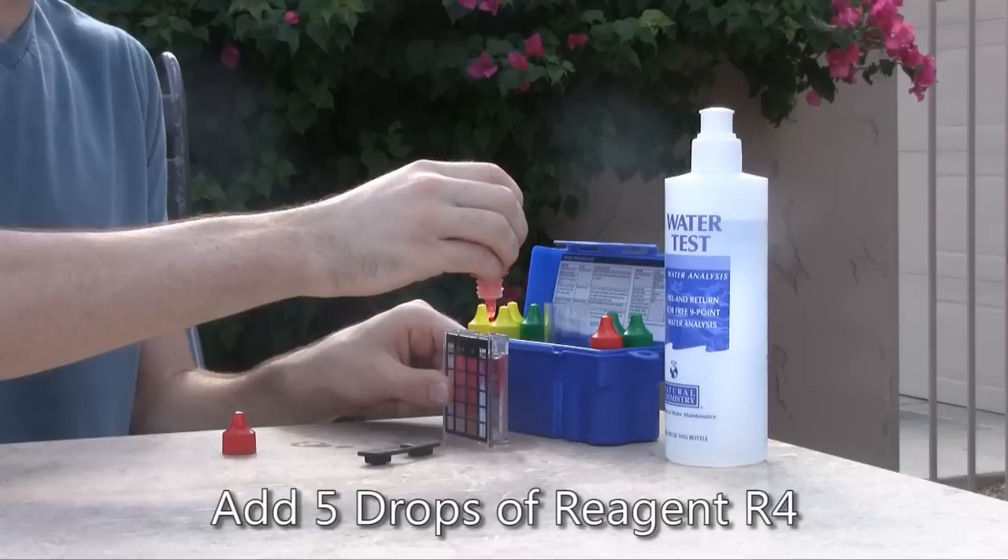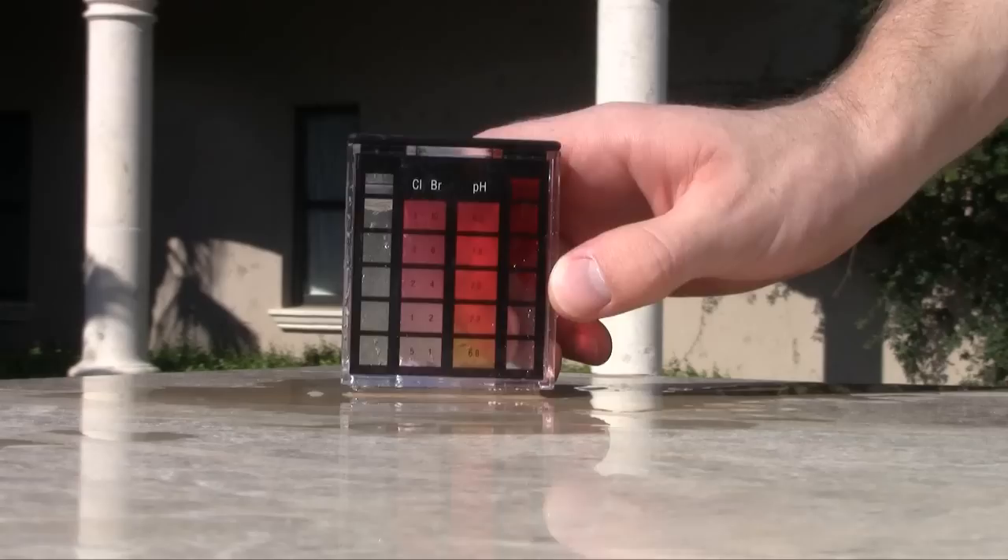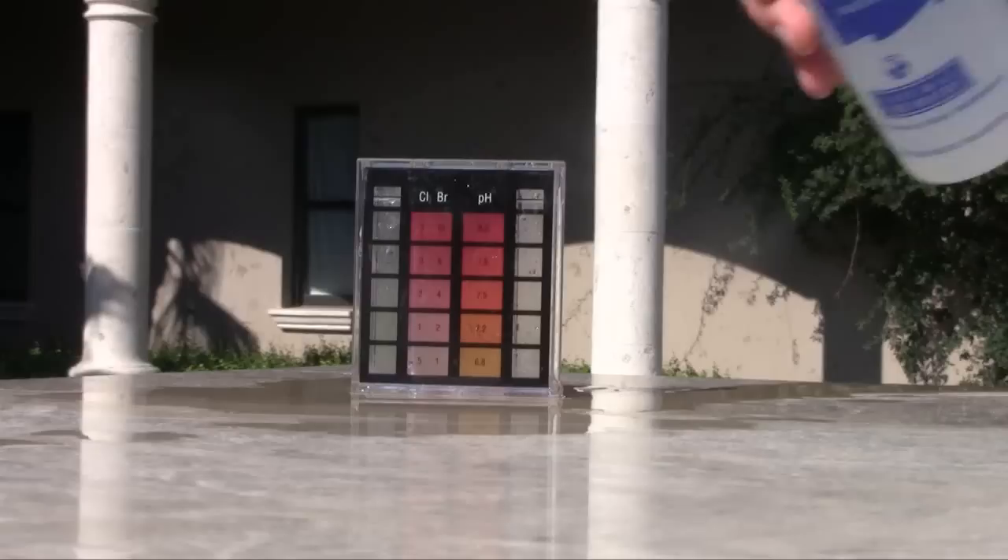To measure your pool water's pH, fill the larger side of the test vial to the top line, then add five drops of reagent R4. Place the cap on the test vial and gently invert to mix the sample. Compare the color of the test sample to the color guide on the test vial. Your pool's pH should be between 7.4 and 7.6.